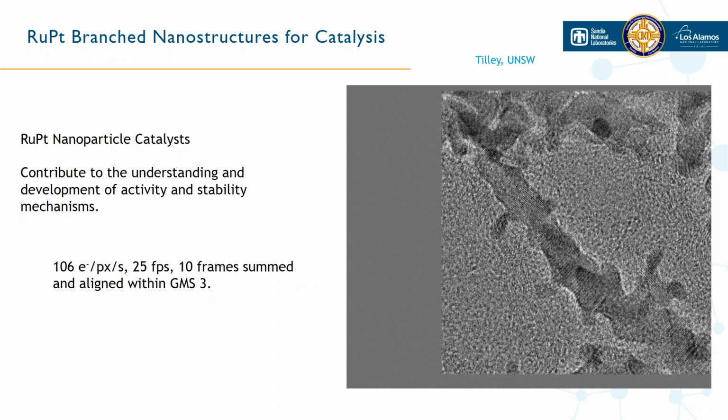Okay, thanks. So yeah, this is looking at some examples of transformations of inorganic catalysts. That's one of the main interests in the TEM, putting these inorganic substrates in and looking at their behavior under industrially relevant conditions. Within the TEM, we can go up to about 10 millibar of reactive gases, and we have heating holders that can go up to 1200 degrees Celsius. So we can really submit some of these to pretty rough conditions.